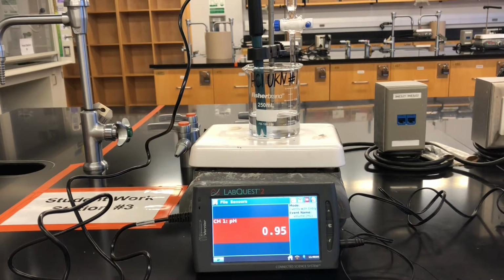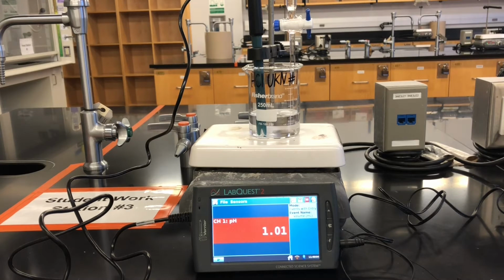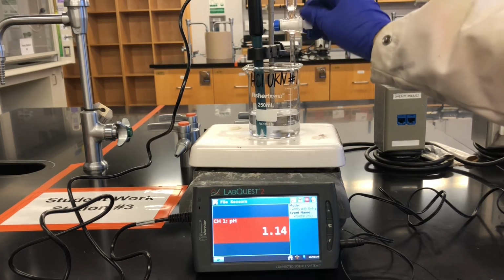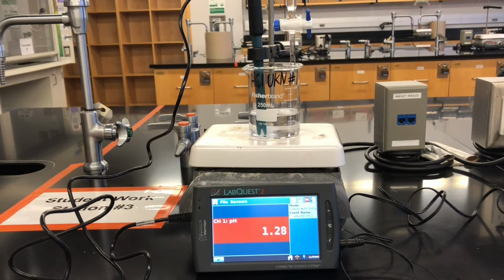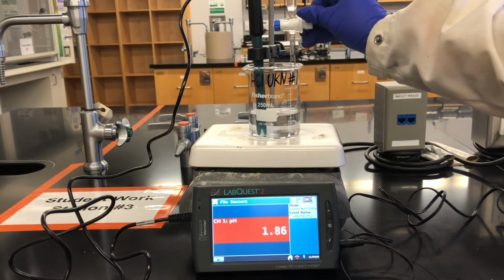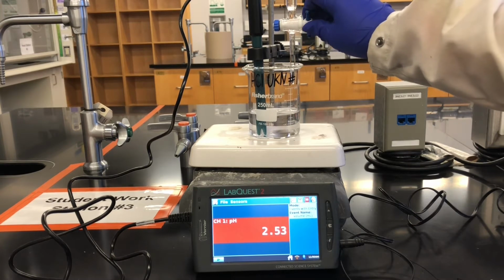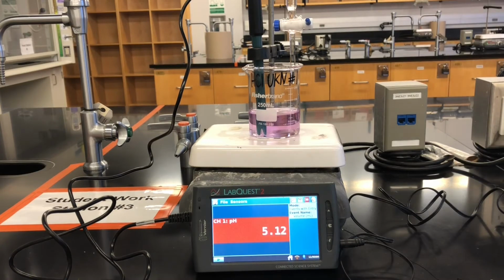With the stirring on, we first perform a fast run to determine the approximate volume of when the endpoint is reached. To do this, we add sodium hydroxide relatively quickly until the solution turns and remains a pink color. After the solution turns pink, we record down the volume on the burette and calculate the endpoint volume. In this case, the final burette reading was 11.00 milliliters. This makes our endpoint at 10.75 milliliters.